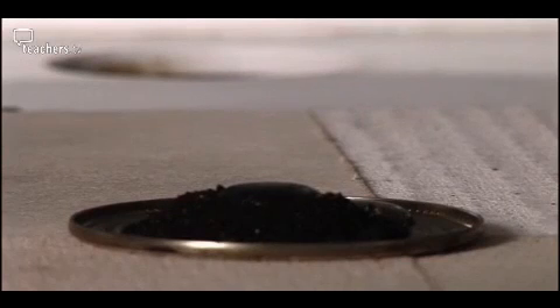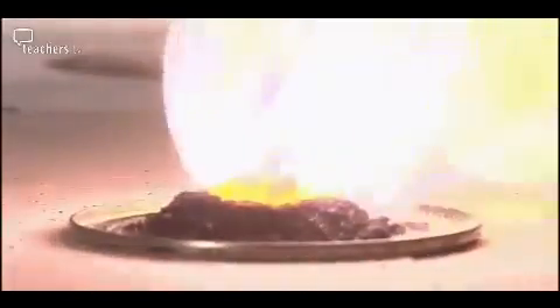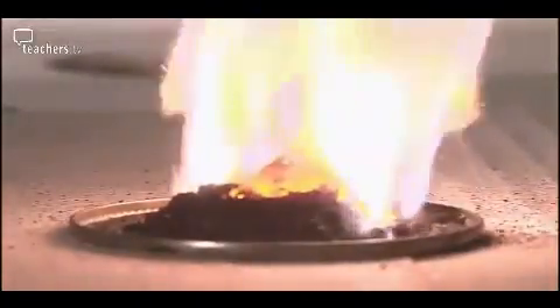There is a time lag for this experiment, but you can use this to build suspense. Now there we go — it's taken off. That's the steam you can see. Look at that flame — pink because of the potassium.